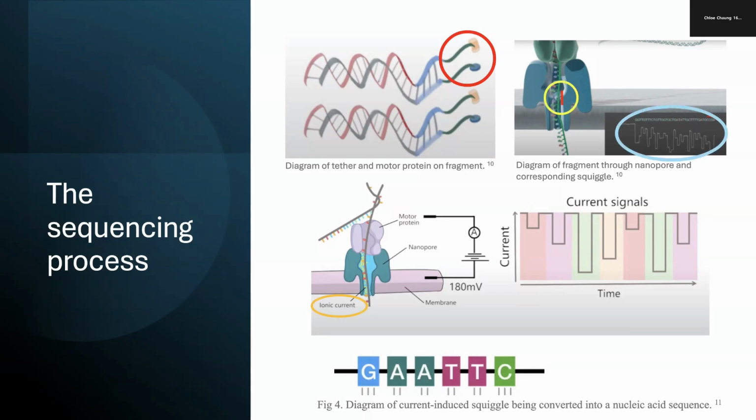Each of these squiggles is unique to the nucleic acid's bases since all the bases are effectively different. Thus, after successive bases pass through, these squiggles can then be converted into DNA or RNA sequences, since base calling algorithms and technology utilize raw electrical data from the current changes.